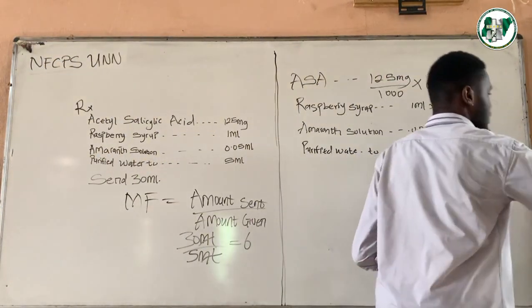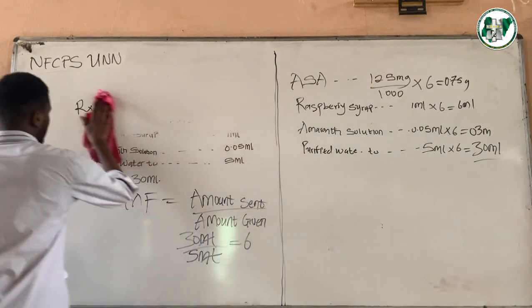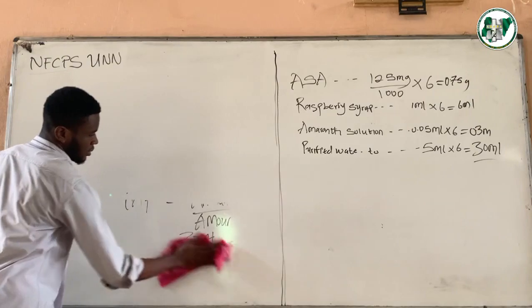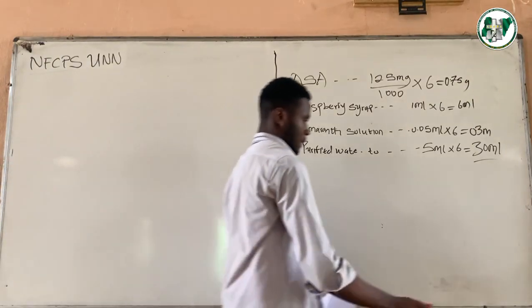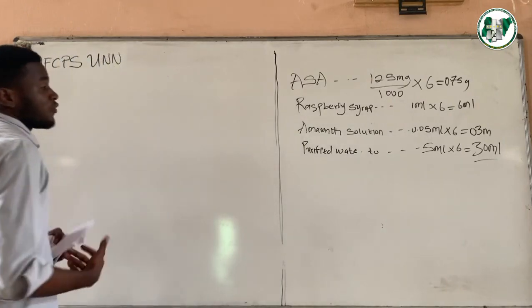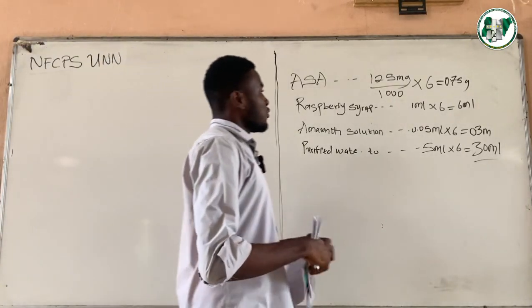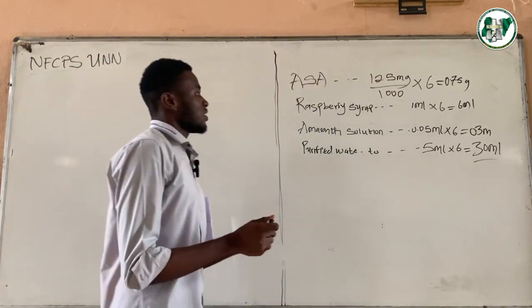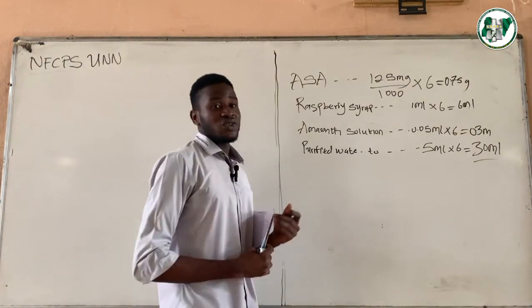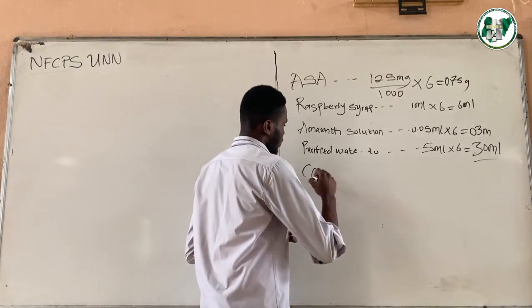Permit me to clean this side of the board. All right, and this is our working formula. From here, remember I told you about the suspending agent. So we are going to be using compound tragacanth.